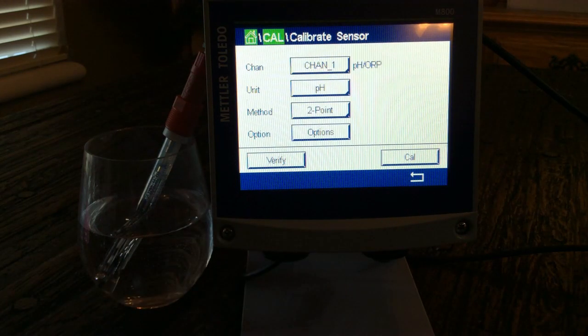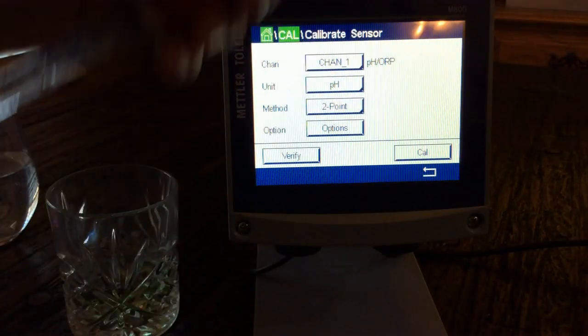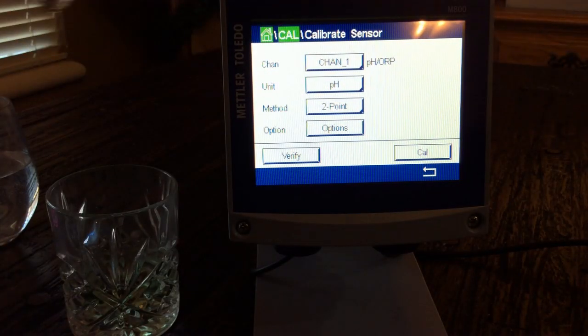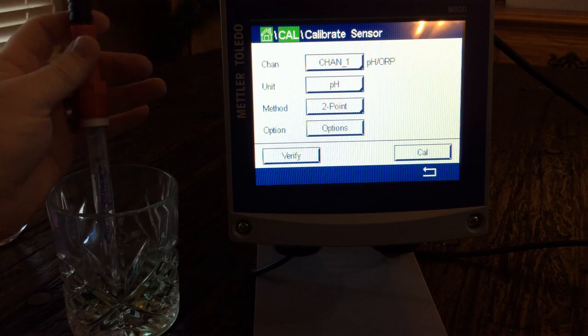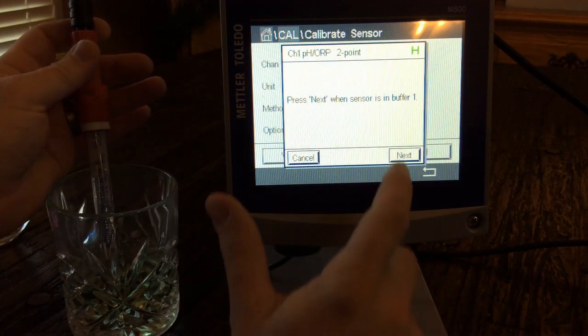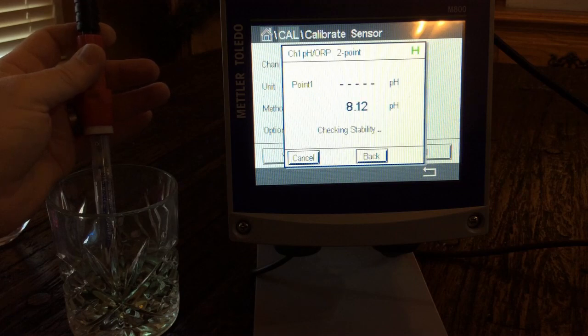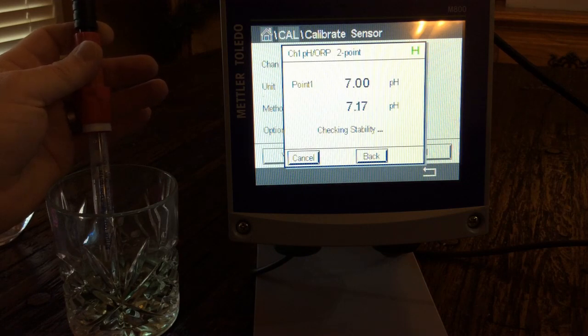First, we get our buffer solutions. I've got my 7 here. I've cleaned off my sensor and put it into the 7 buffer. I hit cal, it tells me to put it in buffer 1, and I hit next. It sits there checking for stability. The H blinking means we're in hold, so we're not getting any erratic readings. It's recognized the 7 buffer and now we are calibrating to our 7.